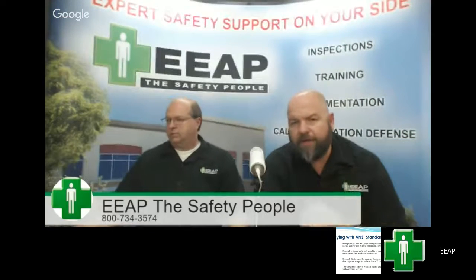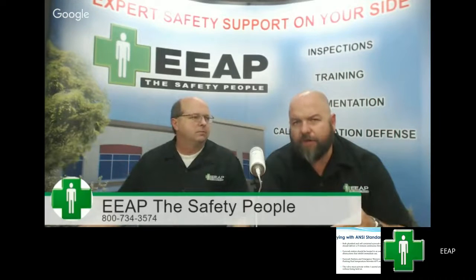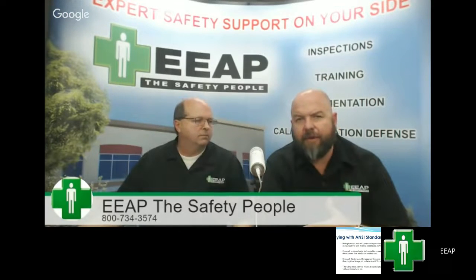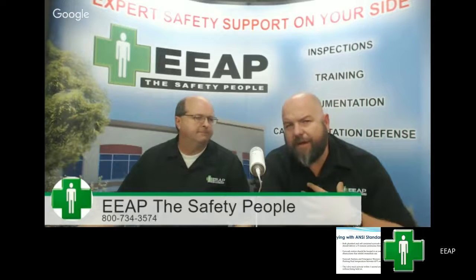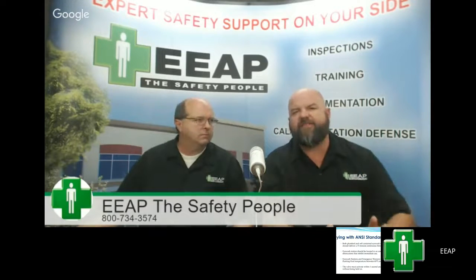And I agree, Rick. And a plumbed-in one is tough to do, but I will tell you that those things can be $30, $50, $60 a replacement cartridge, and you have to have somebody come out and do it. And they're just very tough. So I'm not a big fan of those, but I'm not suggesting they're bad in any way. They're just not my favorite.